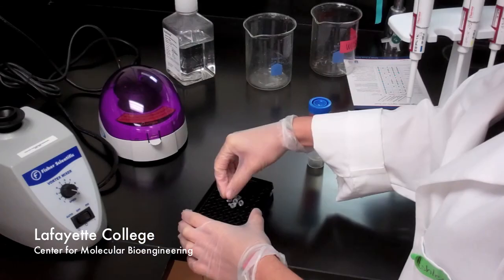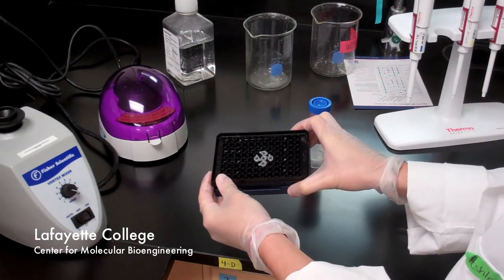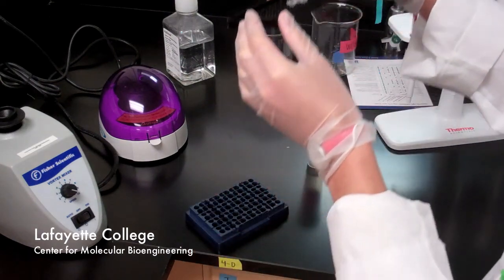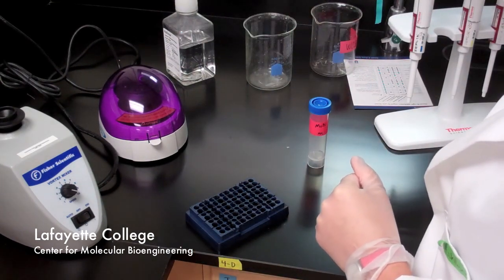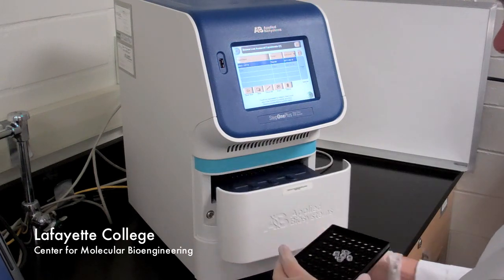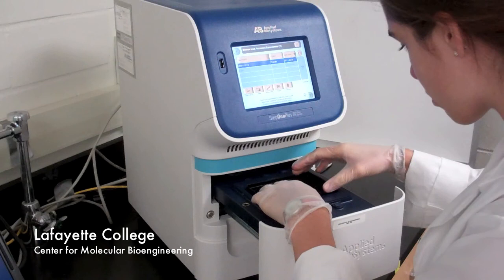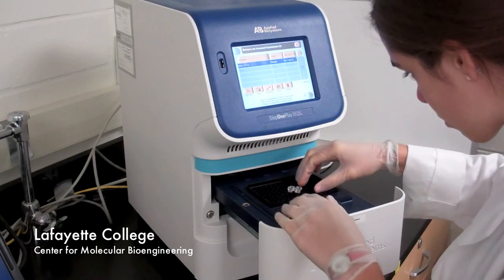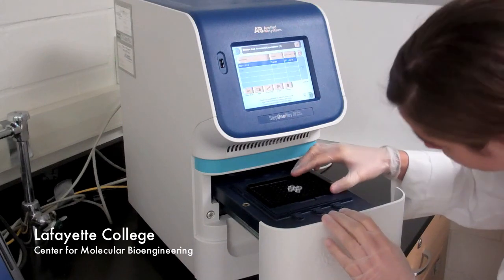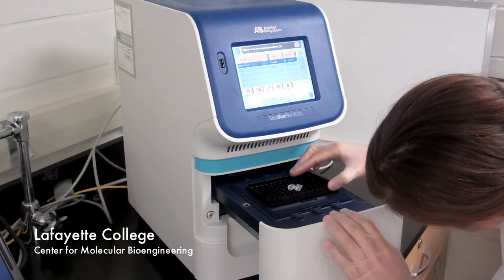Retrieve your samples from the ice, and make sure one more time that there are no bubbles in the tubes, and that all the tubes are securely snapped into place in the Veriflex tray. Open the tray of the thermocycler and place the Veriflex tray into the heating plate. Make sure that all of the tubes are completely submerged into their respective wells of the heating plate. If they are not, you probably have the tubes in the tray upside down.